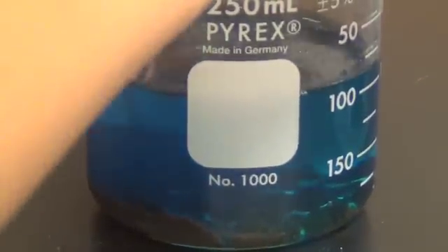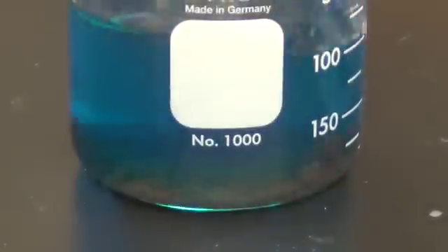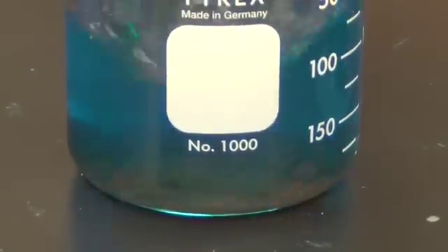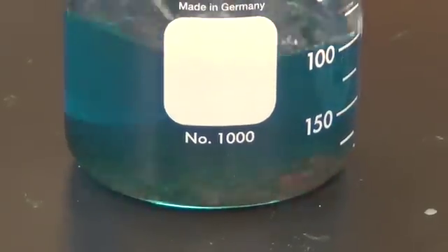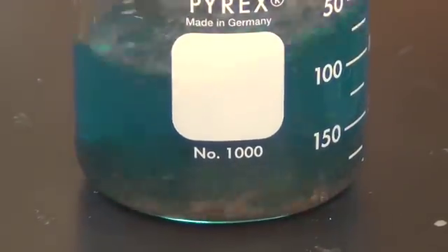Wait, actually wait — something did happen. Go, go, stir, stir. That worked really fast. Brown. Is that brown? Look. This is a much better idea — this is a much better trial than yesterday.